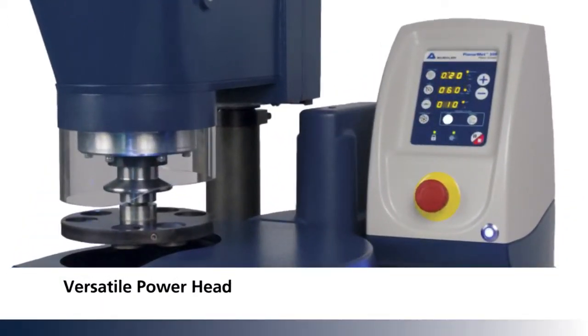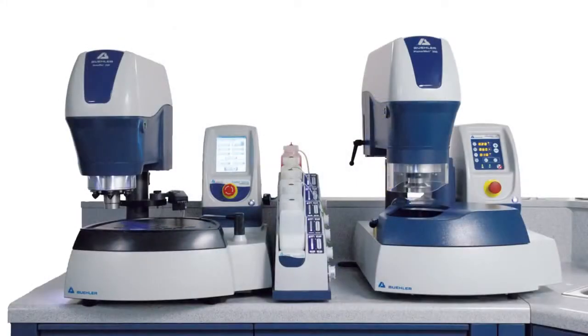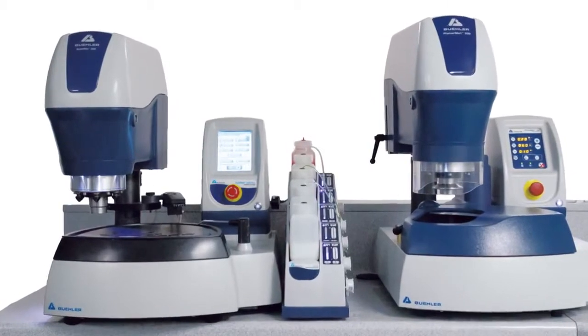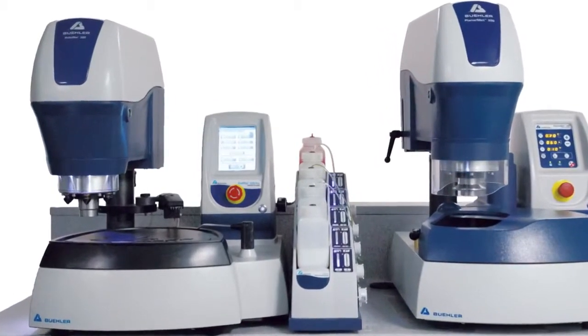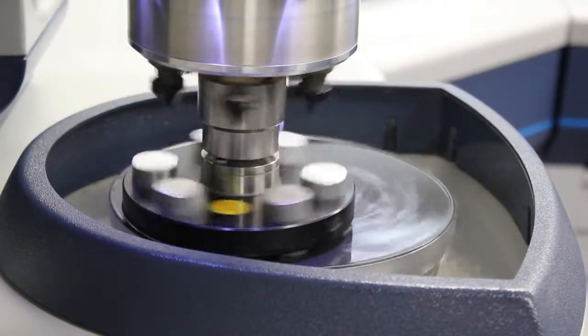The versatile power head, with variable force and head rotation, accepts the same central force specimen holders as the Acomet Automet Grinder Polisher, allowing additional preparation steps to be completed without transferring to a new holder.